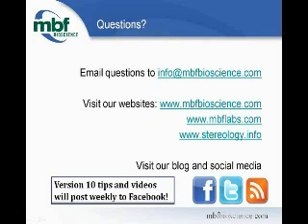We're asked by Brett Schofield if there's any limit to the number of fluorescent channels that can be acquired from an image. We can acquire up to N channels. We have it set to 6 right now because no one's ever asked us to do more than that. But we can certainly do more than 6. We can certainly display more than 6. If you need more than 6, the acquisition would take a little while, but not a whole lot. But we can do up to 6 right now.